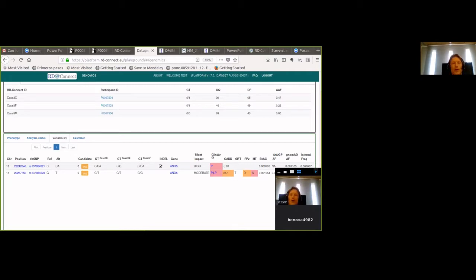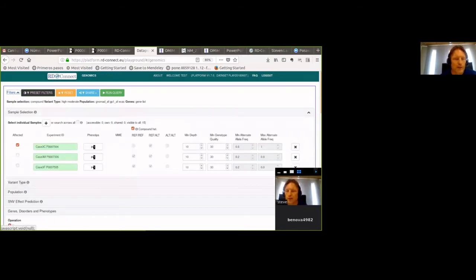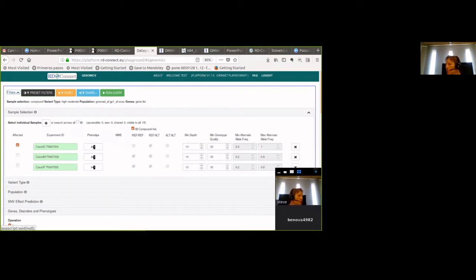That's where I'd like to leave the demonstration. The platform is very flexible — you can use any mode of inheritance, you don't need a trio, you can have an individual, a pair of affected siblings, or a larger pedigree, with all filters still available. It takes a little time to become familiar with, but once you are, it's a very rapid and effective way to get a short list of variants for further testing, or to re-identify variants already known to be implicated in your disease of interest.